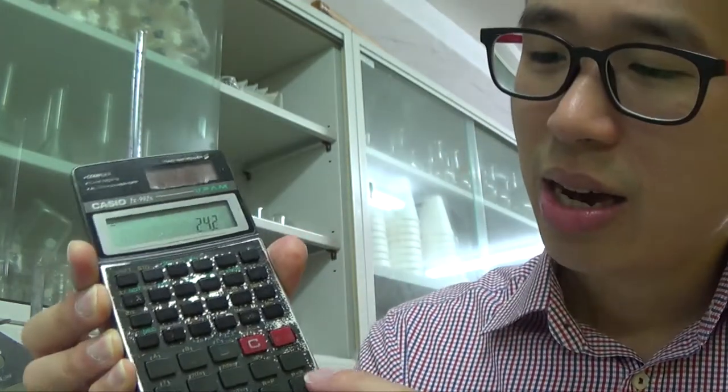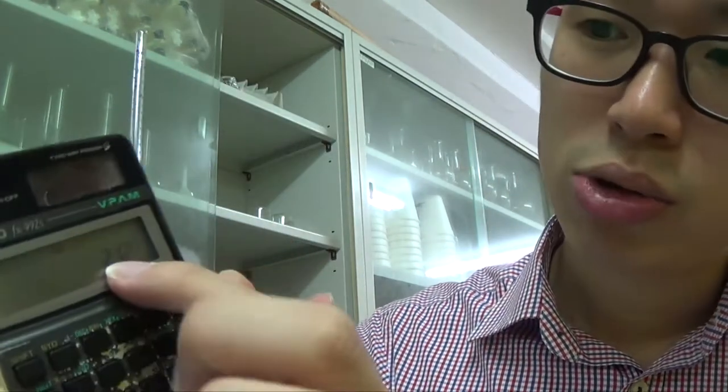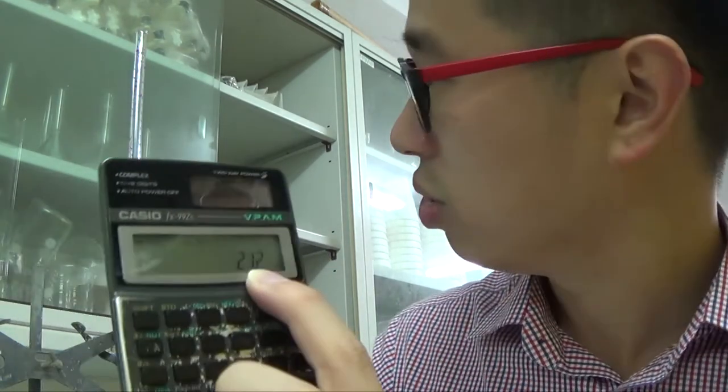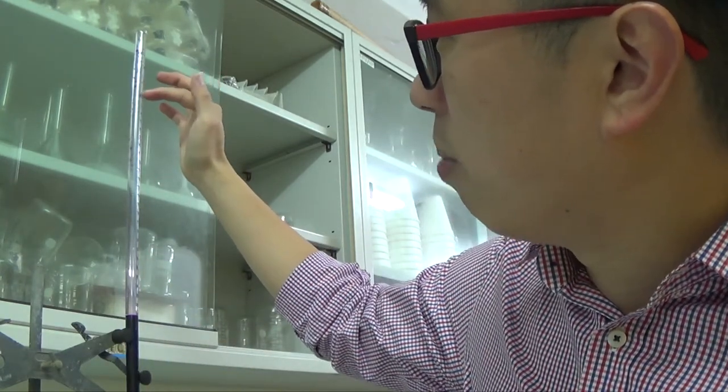So give or take, I did not add too much in excess. I would take away maybe 3.00 cm³. So 21.20 cm³. Okay, if you start from zero, then you will slow down around 21.20. But I'm not going to start from zero, because it's very difficult to read above the meniscus if I start from zero.